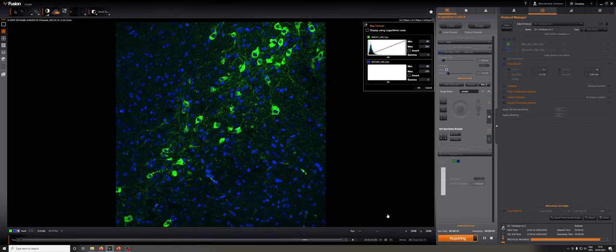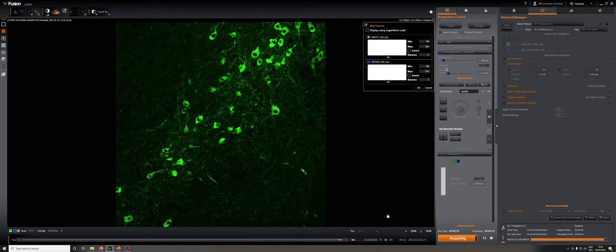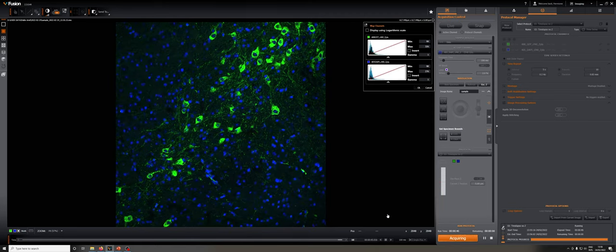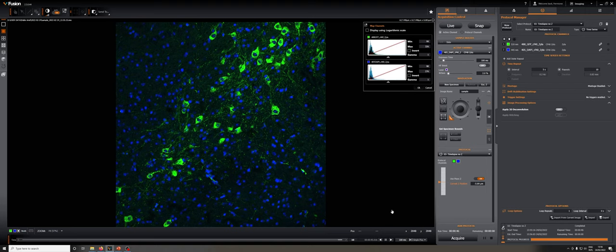The drift stabilization feature measures the distance between the front face of the objective and a specific plane in the sample. If there is a drift in that distance during a time-lapse, the system will adjust the z position to compensate.